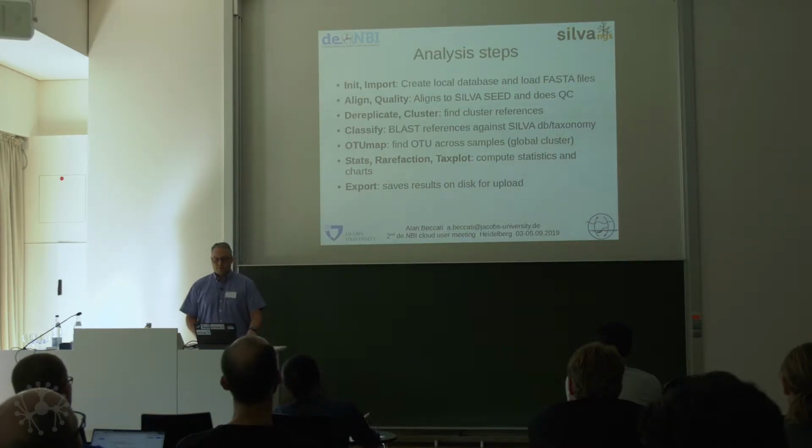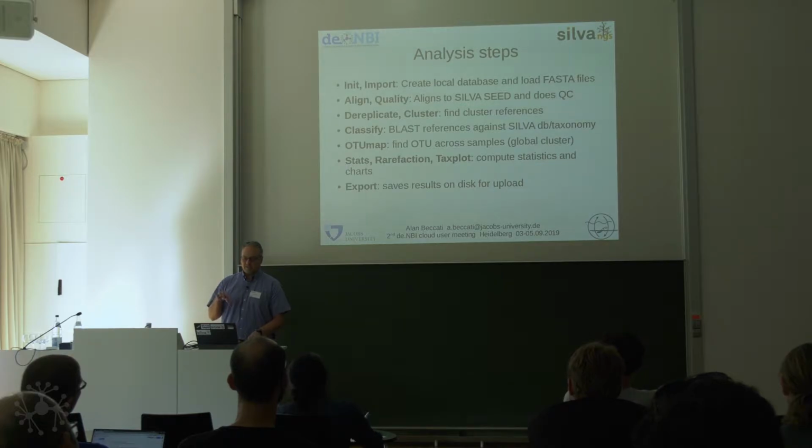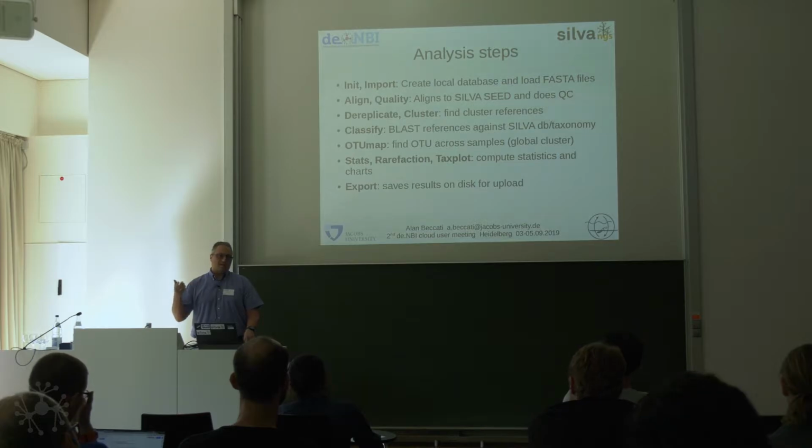Before that, I want to tell you how the analysis platform itself works. It's basically a workflow consisting of several modules, and each module performs one step of the analysis. So there are the init and import modules, which create a local database where all the sequences are stored, and the import will load all the FASTA data from the user into the database. We use a local database to be able to perform analysis on the results and statistics afterwards. So after the processing is done, on the database we can run the analysis and the statistics tools.